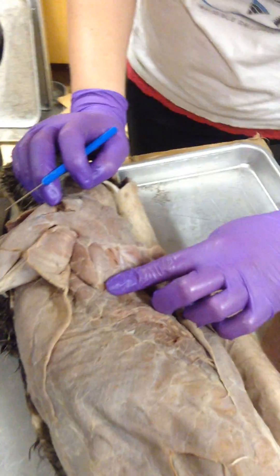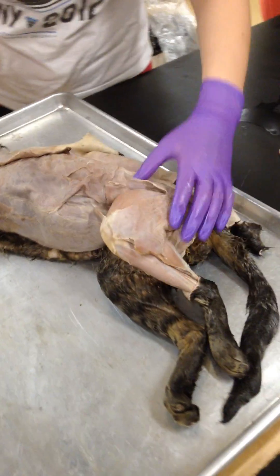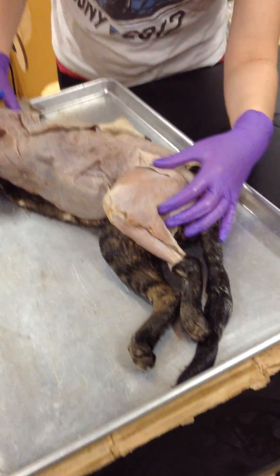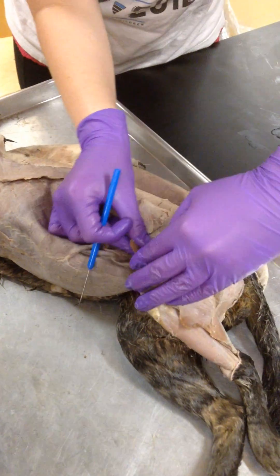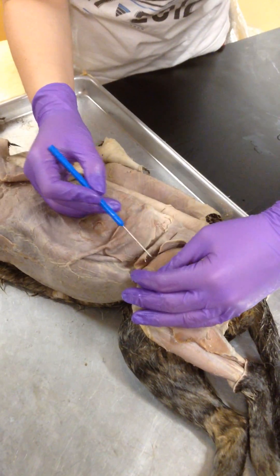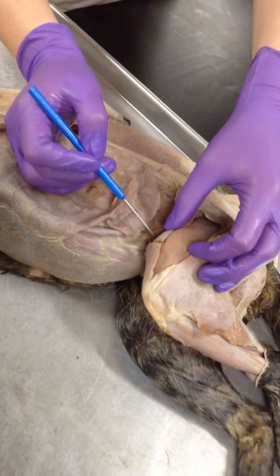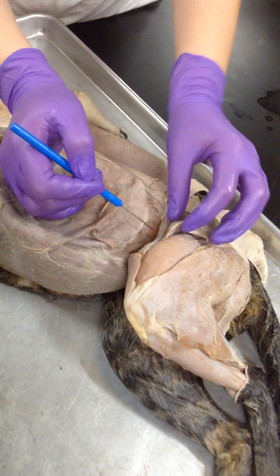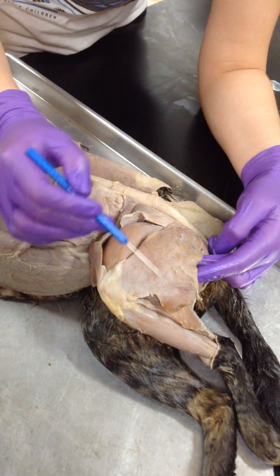That's not a muscle you need to know. And then we go down to the leg. On the outside of the leg, you have — see it? This right here, going down to the knee — that's your sartorius. And then right here, this big thing, that's your biceps femoris.